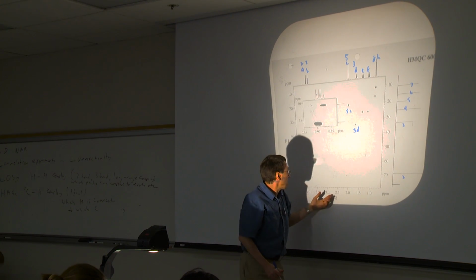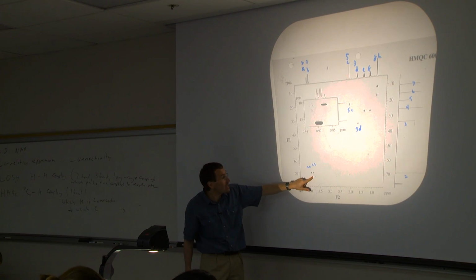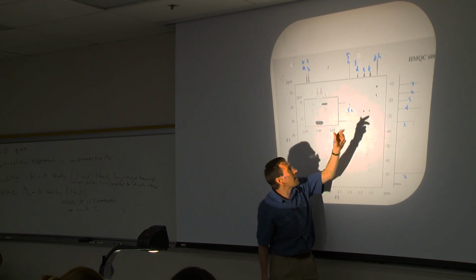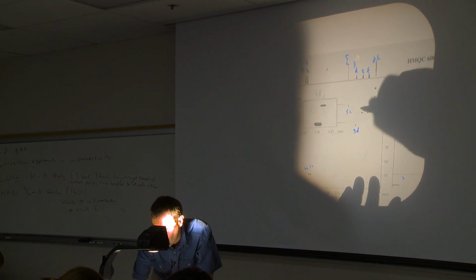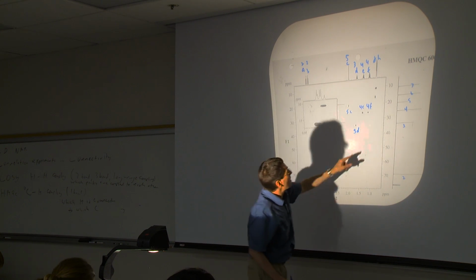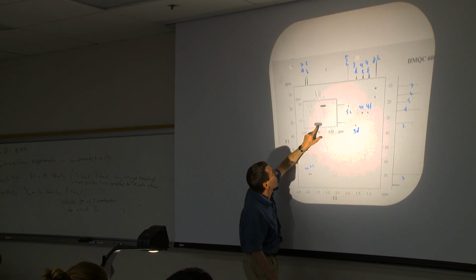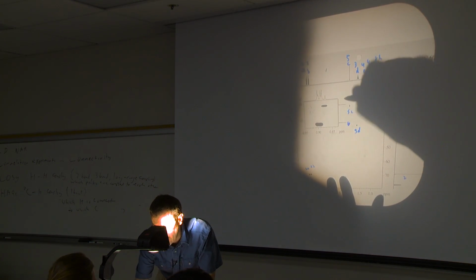Now, we thought we had a stereocenter. We see 2 diastereotopic hydrogens connected to carbon 2. And we also see that we've got 2 diastereotopic hydrogens connected to carbon number 4. So in other words, 4 gives us 4E and 4F. It gets a little crowded over here. I can kind of see that 6 lines up with G and 7 lines up with H. There's an expansion here to help you out if you're having trouble seeing it.